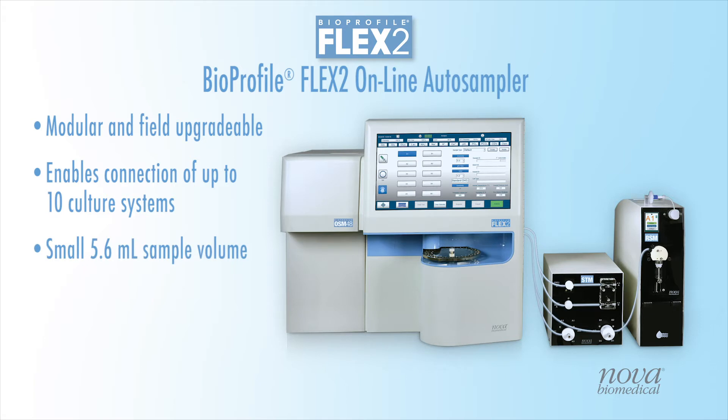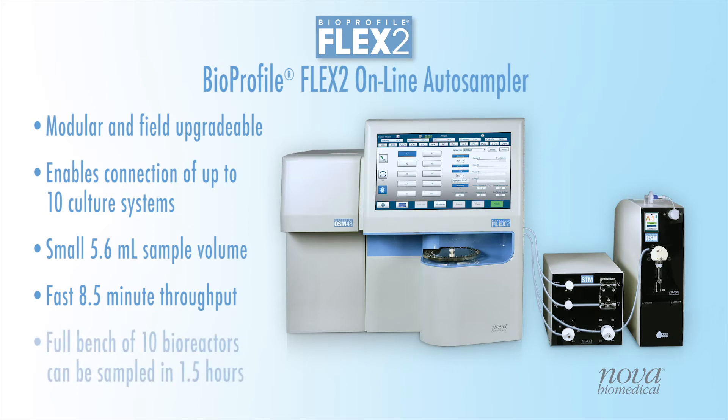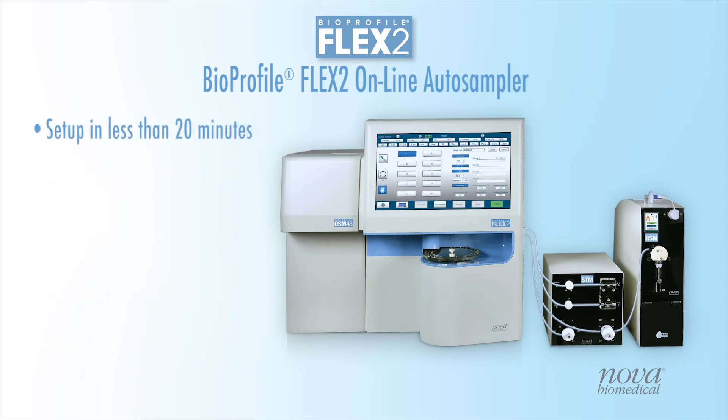The OLS's small sample volume of just 5.6 milliliters and fast analysis time of just 8.5 minutes provide automated sampling and analysis of 10 bioreactors in less than 1.5 hours. Setup time for a full 10 bioreactor system requires less than 20 minutes.